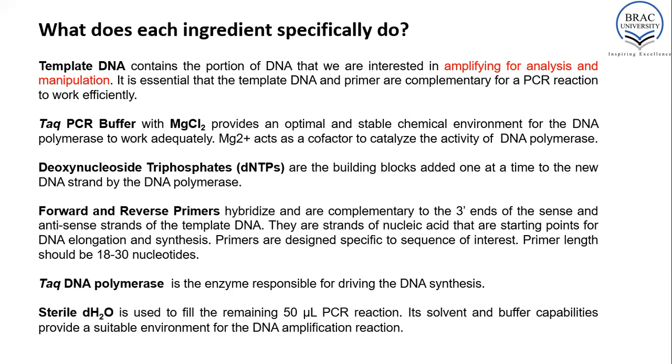If a primer has more guanine and cytosine, it can form a secondary structure and then not bind to the single-stranded DNA, which we really want. Then the primer should not be self-complementary. If the primers are self-complementary, they will bind together and form a primer dimer.